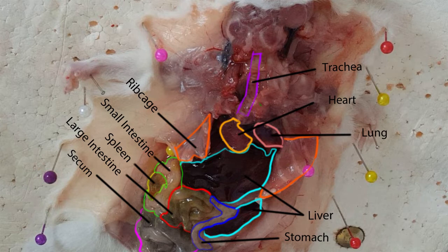Cecum is a pouch that is connected to the large and small intestine. Food is temporarily stored in the cecum while helpful bacteria digest the cellulose found in the plant cells. Most herbivores have a large cecum. In humans and other omnivores, the cecum is much smaller and referred to as the appendix.